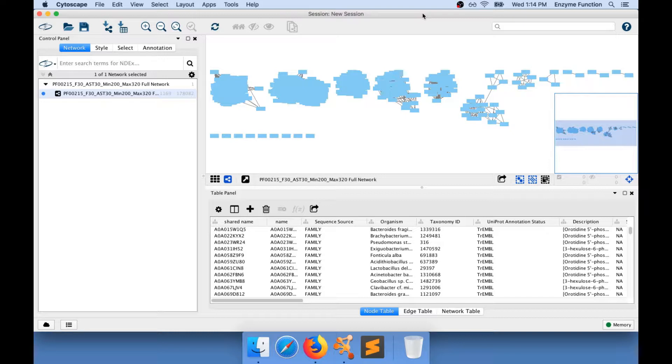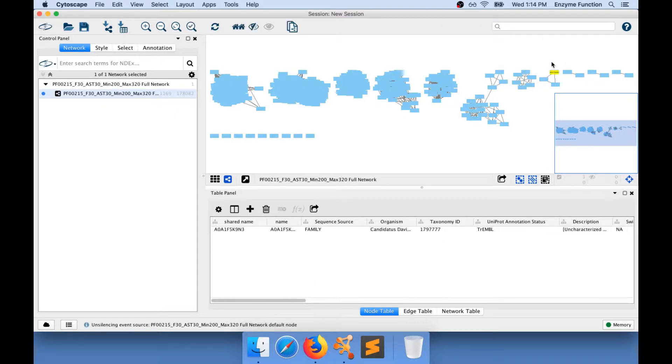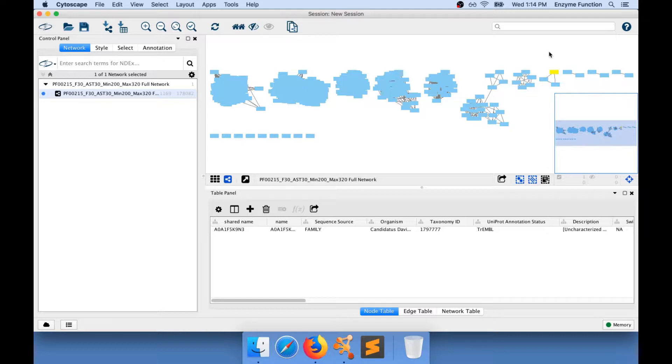In a sequence similarity network, we have nodes, a blue box, and nodes represent protein sequence or a set of protein sequences.